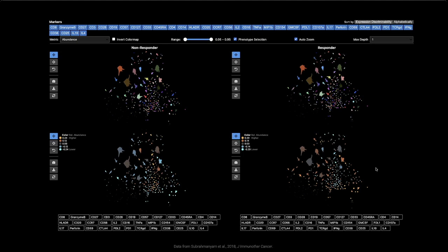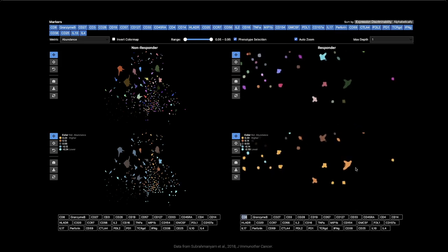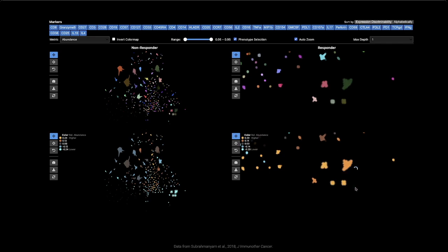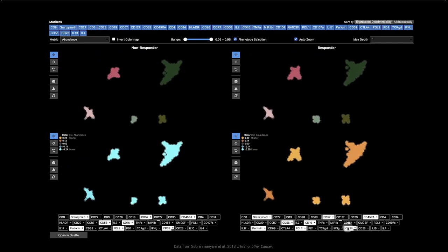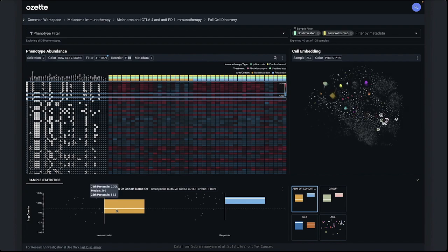One of the challenges with traditional methods for identifying differentially abundant phenotypes is a lack of context to other related phenotypes. Embeddings provide us with a visual tool to pinpoint groups of related phenotypes that exhibit similar shifts according to our metric. For example, this group of cells in the bottom right, which display a positive shift. Our metric is telling us visually that there are differences between these groups. But we can again examine these phenotypes in a more statistically robust framework to verify that these phenotypes are actually differentially abundant, and in this case, again, they are.